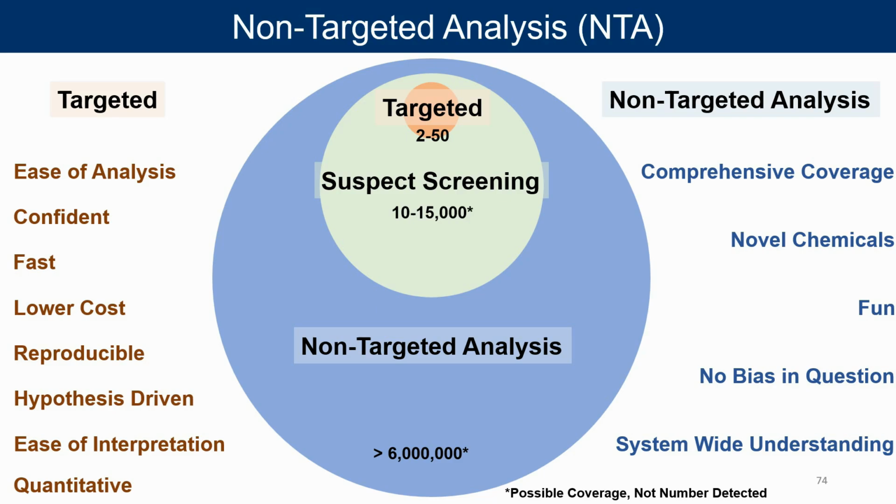For the non-targeted analysis, again, we're using universal principles of chemical properties to try to understand what this new chemical is, and we have so many lines of evidence we can look at, and it's a big puzzle. And so all of the following tutorials will be looking at different pieces of that puzzle, how each one can provide information whether something is or isn't a PFAS, and even maybe its molecular formula, what atoms are in that PFAS, and maybe even what the structure of that PFAS is.